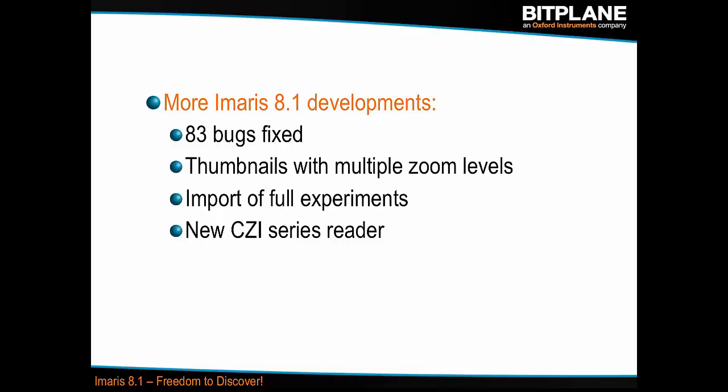It is also based on the HDF5 structure, which means it has multiple levels of resolution, and you can access each of the levels depending on what zoom you are in. So if you're zoomed very high into the image, you get this small area at high definition. If you're zoomed out, you get the whole thing at low resolution. And the Zeiss file format has the same behavior.